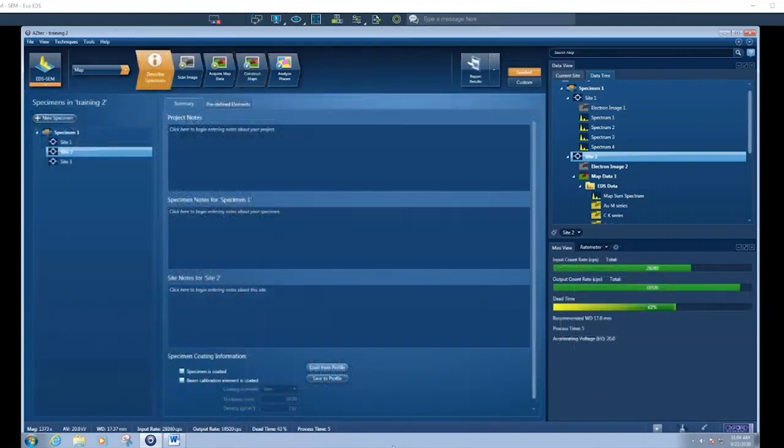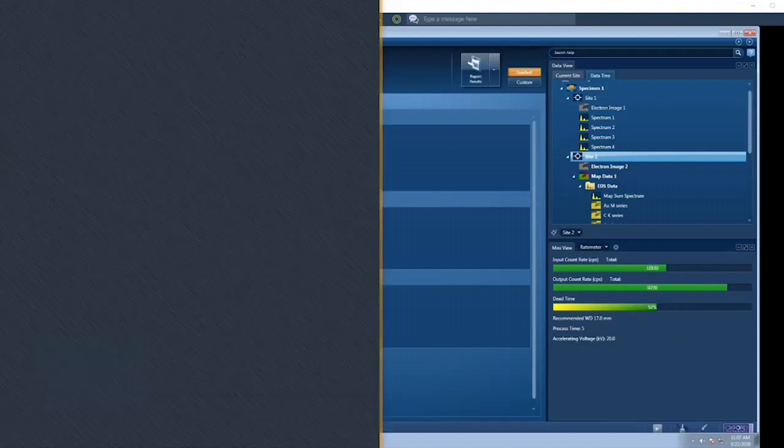Excellent. All right. Well, we'll leave it at that then. If there's nothing more, well, actually, I'll just go through the finishing process of the safety in terms of taking out the detector. I'll just quickly do that.